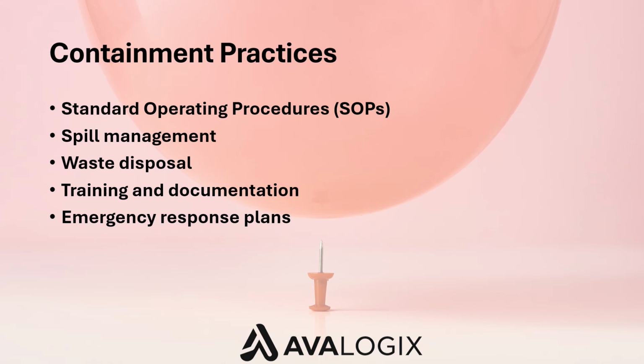For example, every time an agent is removed from cold storage or transferred between labs, it should be documented. Waste management must follow precise protocols to ensure that no hazardous materials exit the lab unneutralized. Training is another pillar. New staff should undergo theoretical and practical training before being allowed to work independently. Annual refreshers and emergency response drills are recommended, especially at BSL 3 and BSL 4.